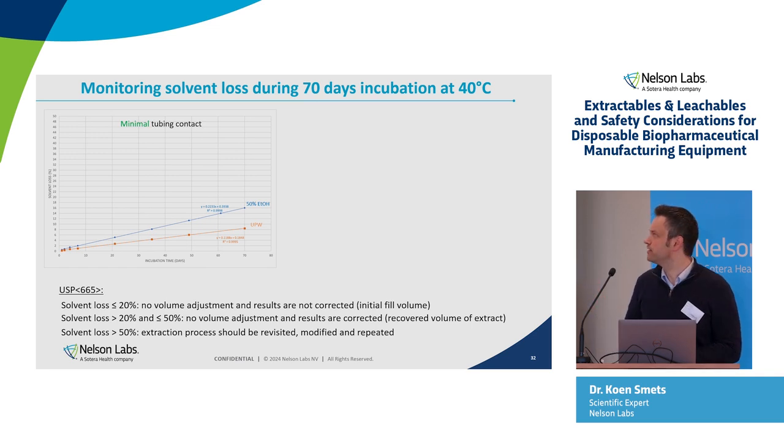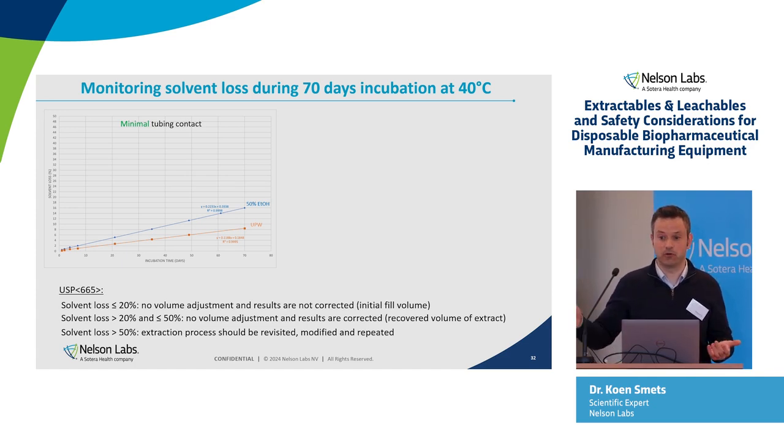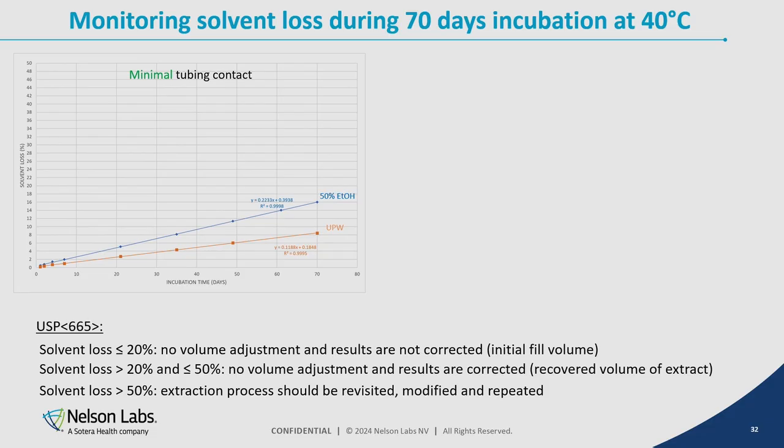And at this slide, you can see the results for the 50% ethanol extraction solvent and the aqueous extraction solvent. And the first observation is that you can see that the solvent loss is almost a linear equation. So the longer you store a test item, the more risk for solvent loss. It is quite straightforward. And also the 50% ethanol solvent gives a higher solvent loss than the aqueous solution. So that's still in line with expectations.